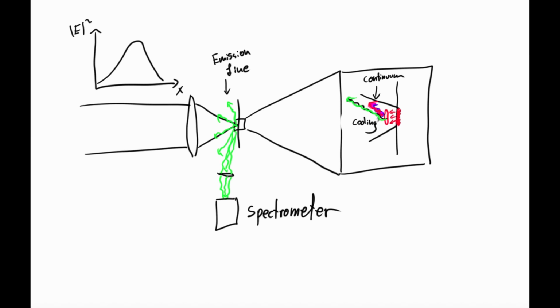Because the laser plasma is a pulse source, the resulting spectrum evolves rapidly in time. Additionally, multiple firing lasers can penetrate deeper into the sample and measure composition below the surface of a sample.